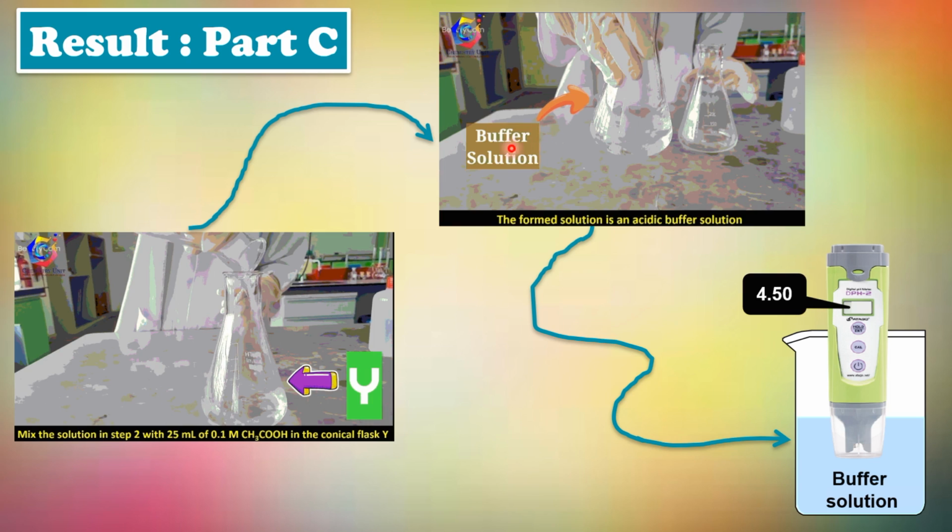The conical flask X refers to the conjugate base or the salt, and it will react with Y, which is actually the weak acid. When mixed together, it forms a buffer solution, and by using a pH meter you have to determine the pH of the buffer solution, and the reading here is 4.5.